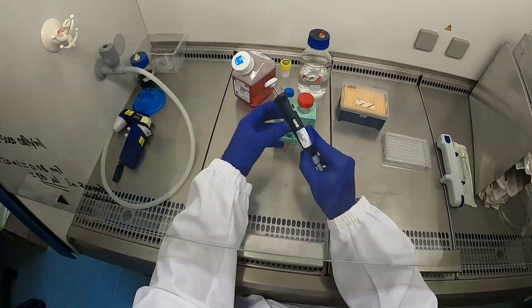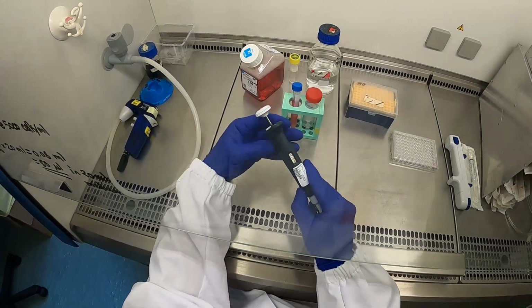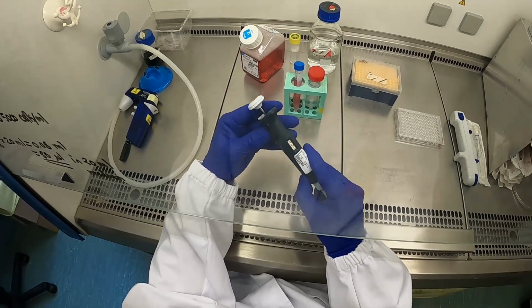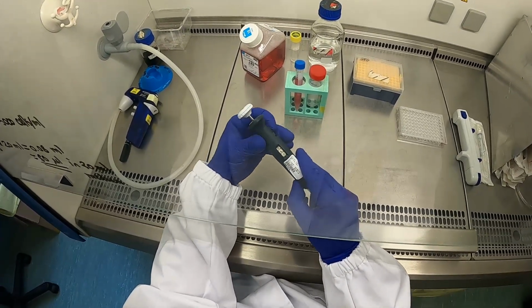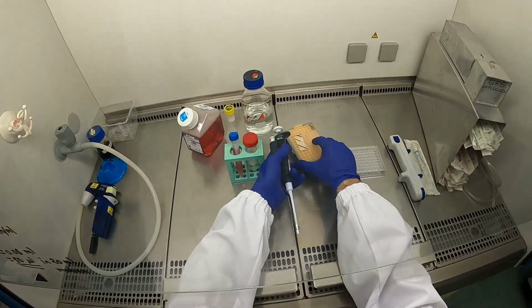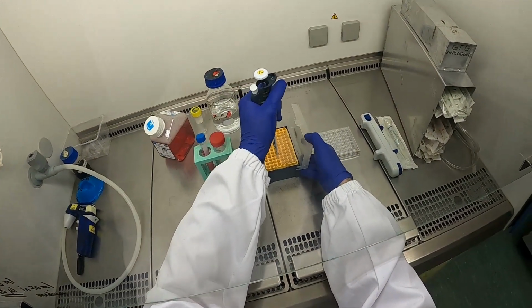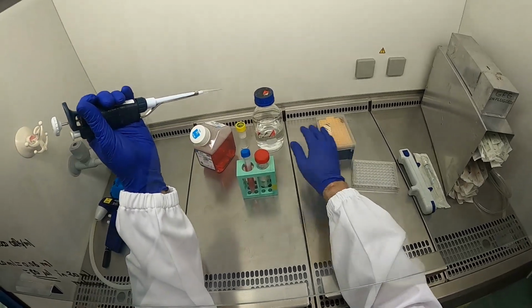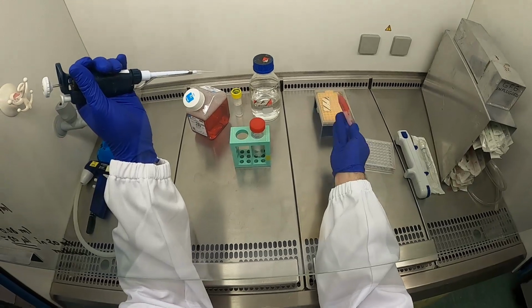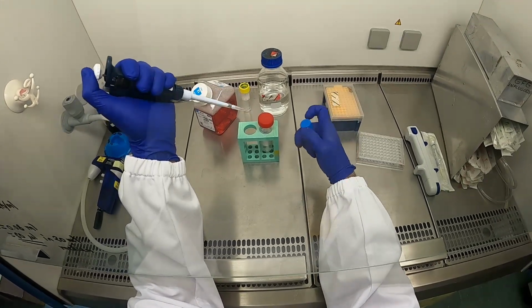Get everything ready. You have your cell suspension. Adjust the pipette to 80 microliters. Take a tip. Everything is sterile. Be careful with it. Mix the cell suspension because the cells will slowly sink to the bottom. Take 80 microliters.